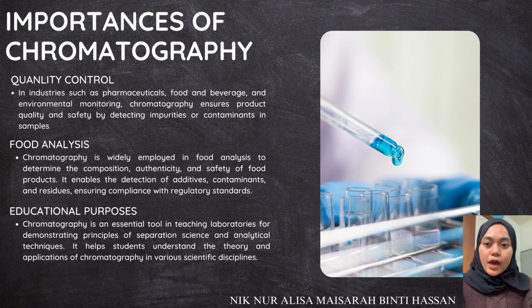Second, food analysis. Chromatography is widely employed in food analysis to determine the composition and safety of food products. It enables the detection of additives, contaminants, and residues, ensuring compliance with regulatory standards.